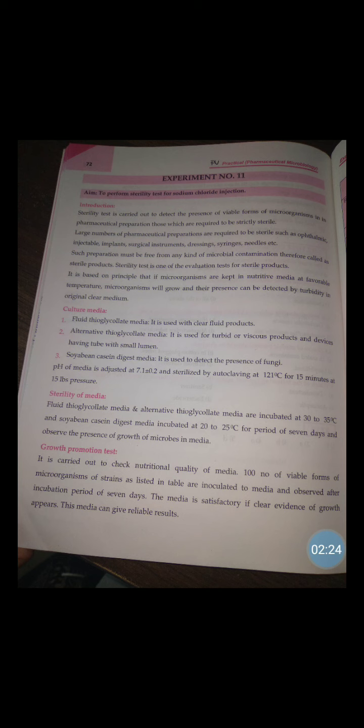Alternative thioglycolate media is used for turbid or viscous products and devices having tubes with small lumen. Soybean casein digest media is used to detect the presence of fungi.